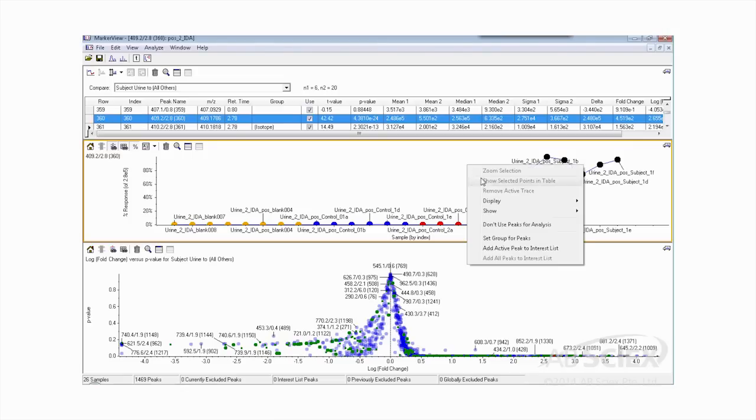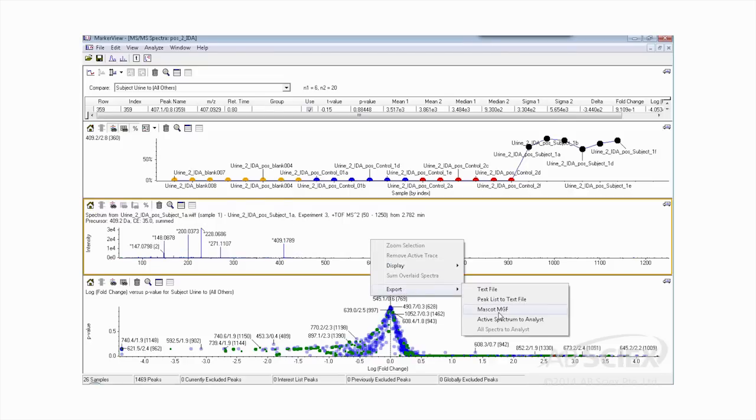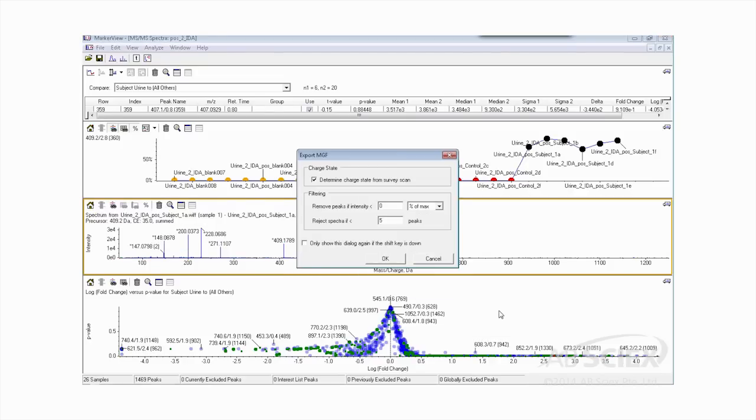As you can see, the groups are well differentiated and we can use the PCA plot to further identify the variables responsible for this difference. MS-MS data is linked in MarkerView for exporting to online database searching, such as the Human Metabolome Database and MassBank.